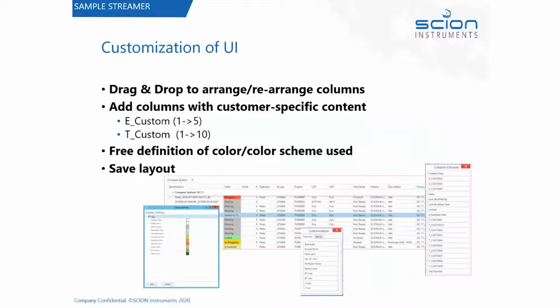Another area that is very interesting from Compass's point of view is what's called the custom variables or the system variables, where you can define particular variables, maybe for calculations or for additions of standards, or whatever custom variable you need to enter into that sample detail.